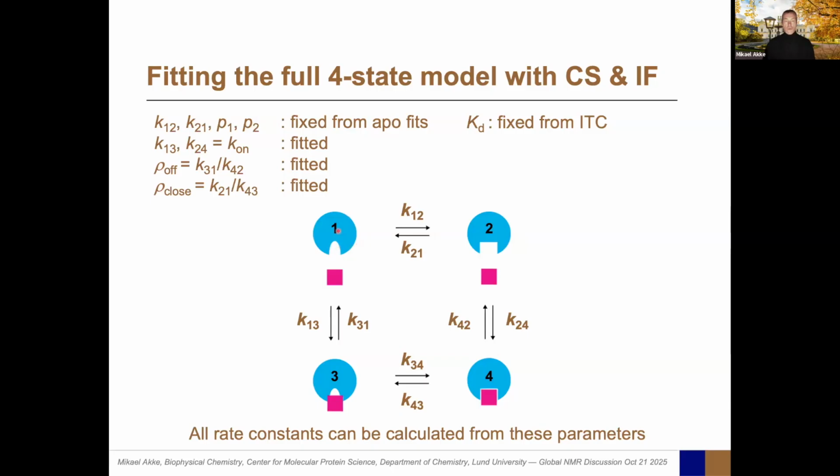And then also we should realize that with NMR, the on rate we're measuring is basically when the ligand contacts the binding site. So any event like the ligand forms a transient encounter complex, maybe binds on the backside, and then maybe diffuses along the surface of the protein and ends up here, and so on and so forth. All of such phenomena should be the same because the structure is quite similar. If the structure had been very different, then maybe the diffusion there wouldn't be the same, and then the on rate wouldn't be the same.